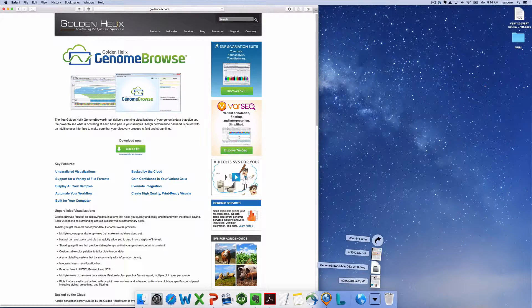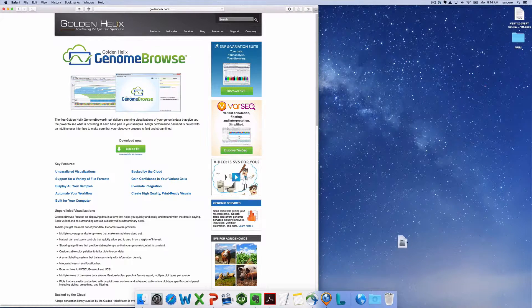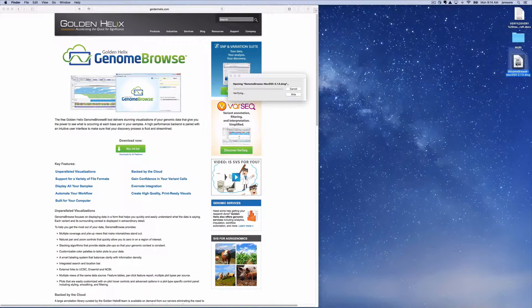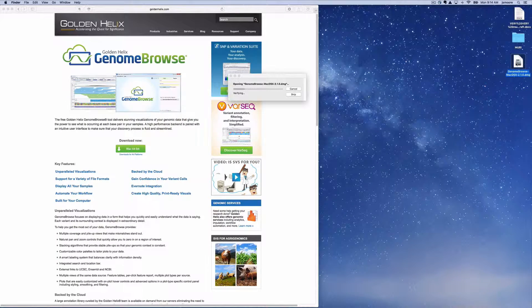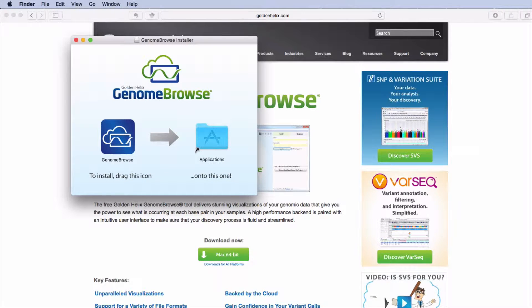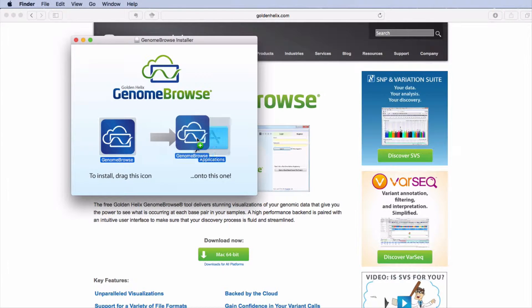Move the file to your desktop and double-click on the DMG icon. Drag the Genome Browse icon into the Applications folder.